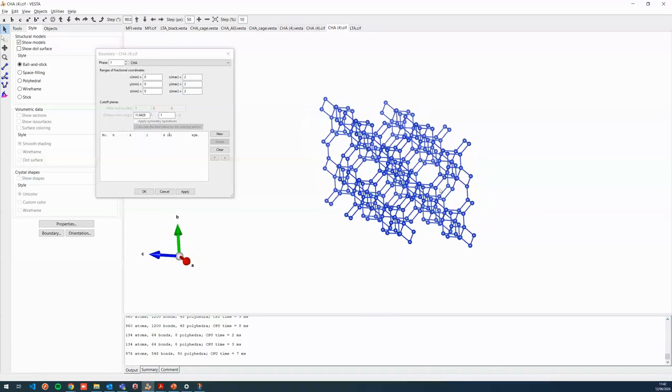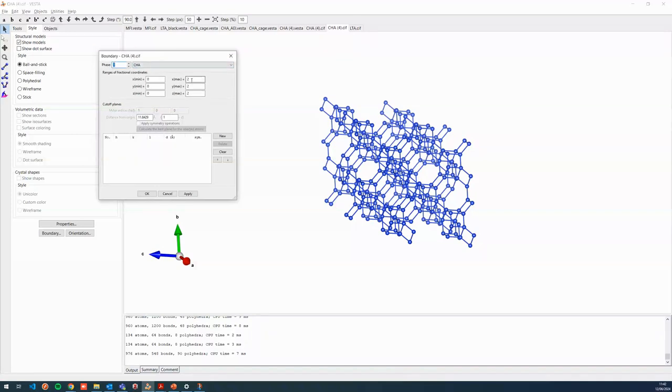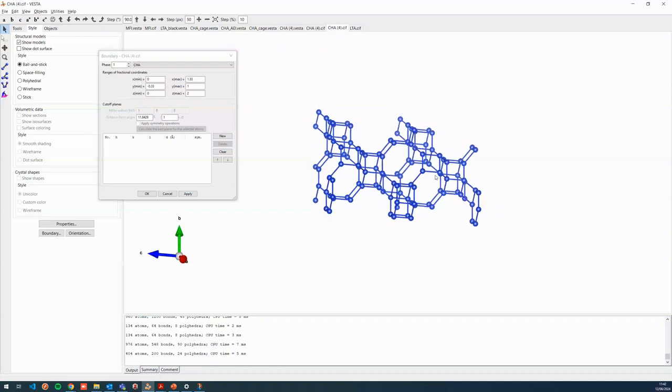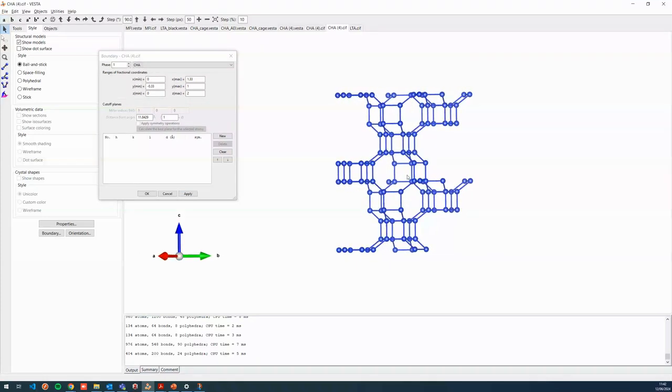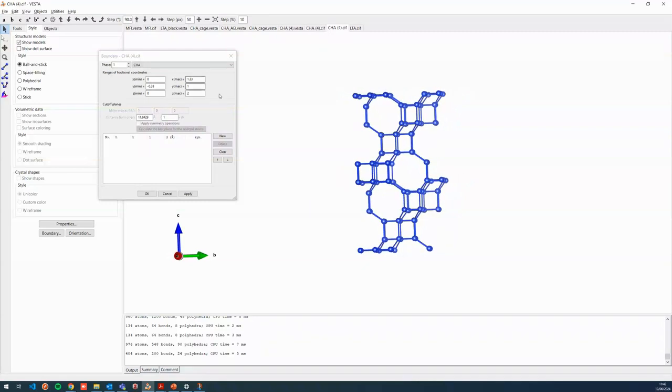You could also make use here of better boundaries. If you already think about how the boundaries look, I've done this prior by looking into the crystallographical structure. Then you can already guess like, okay, this way is going to be looking quite nice. For example, I'll showcase here like so. You get already the cage.